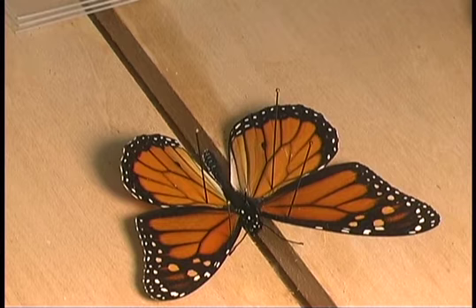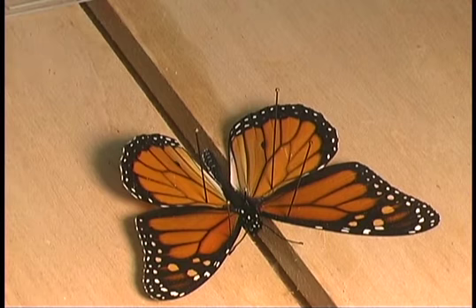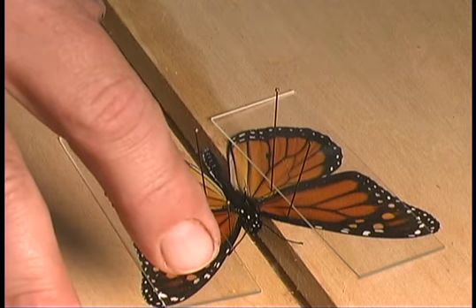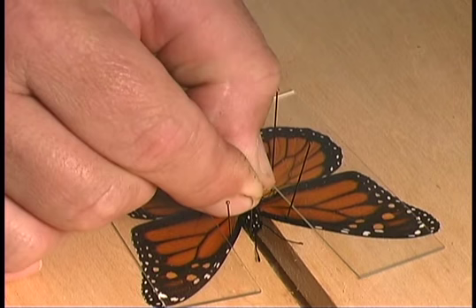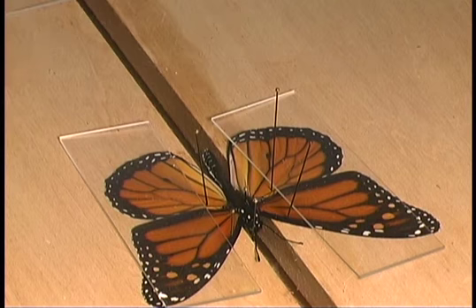Once you have the wings positioned the way you like them, there are two ways to hold those wings flat against the board so they can dry properly. Glass slides work well because they're heavy and will literally sit on the wings and hold them flat. You can also use paper, placing it on the board and inserting pins through it to hold the wings flat. Once you've placed your glass strips or paper on the wings, make sure the antennae are properly positioned using insect pins so they are as flat against the board as possible and out in front of the insect. This will keep you from breaking the antennae when adding labels after the specimen is dried.